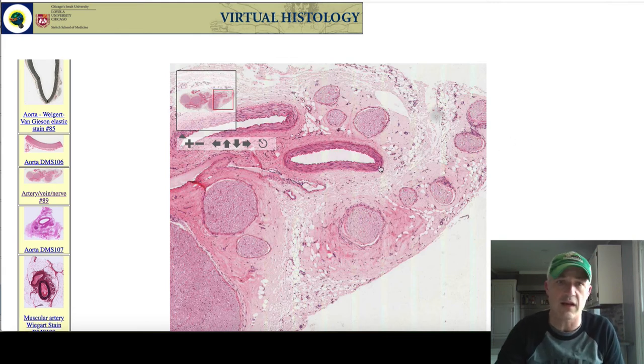And again, this is something I may put on as part of an actual exam. I might use some of these images and have you identify some of them when we do the lecture exams. So just giving you a chance to see those ones. Here you go.